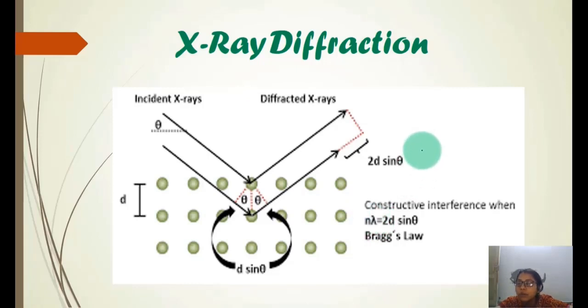For example, in light diffraction phenomena, you observe a bright fringe, then dark, then bright, then dark. So that bright fringe basically was your first order spot. The first bright fringe, that is the central maxima, is the first bright spot. Then the first maxima is the second spot, and then the second maxima will act as the third spot. So that will give you the order of the diffraction pattern.